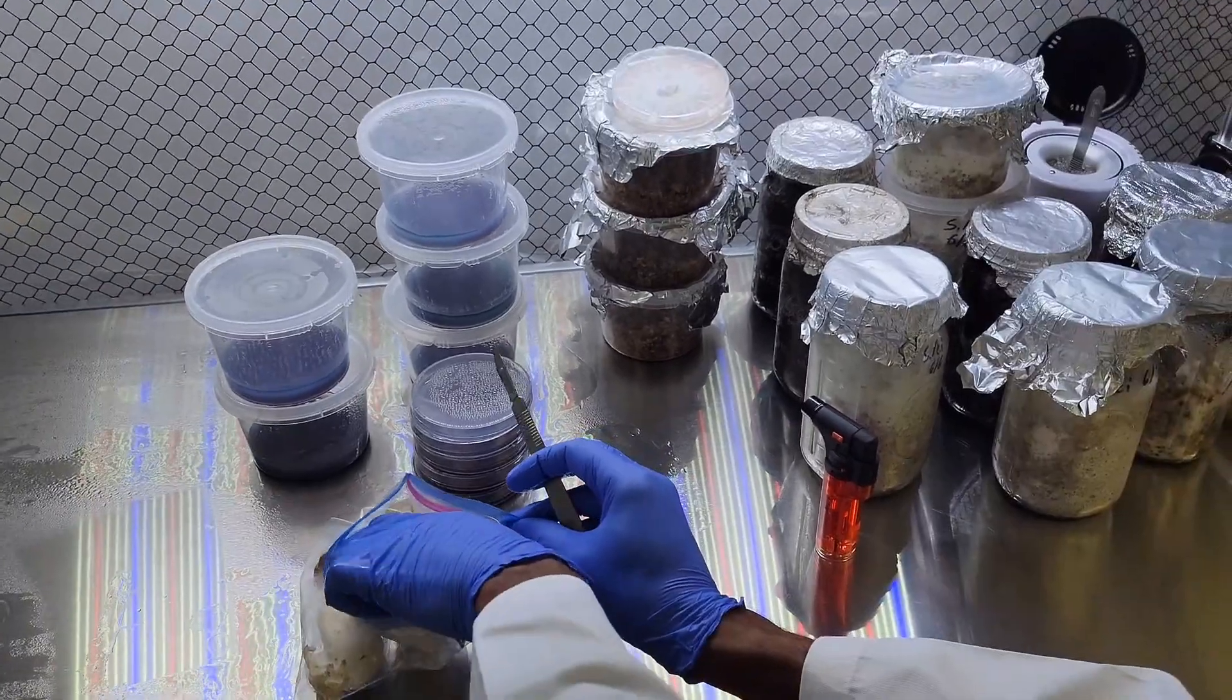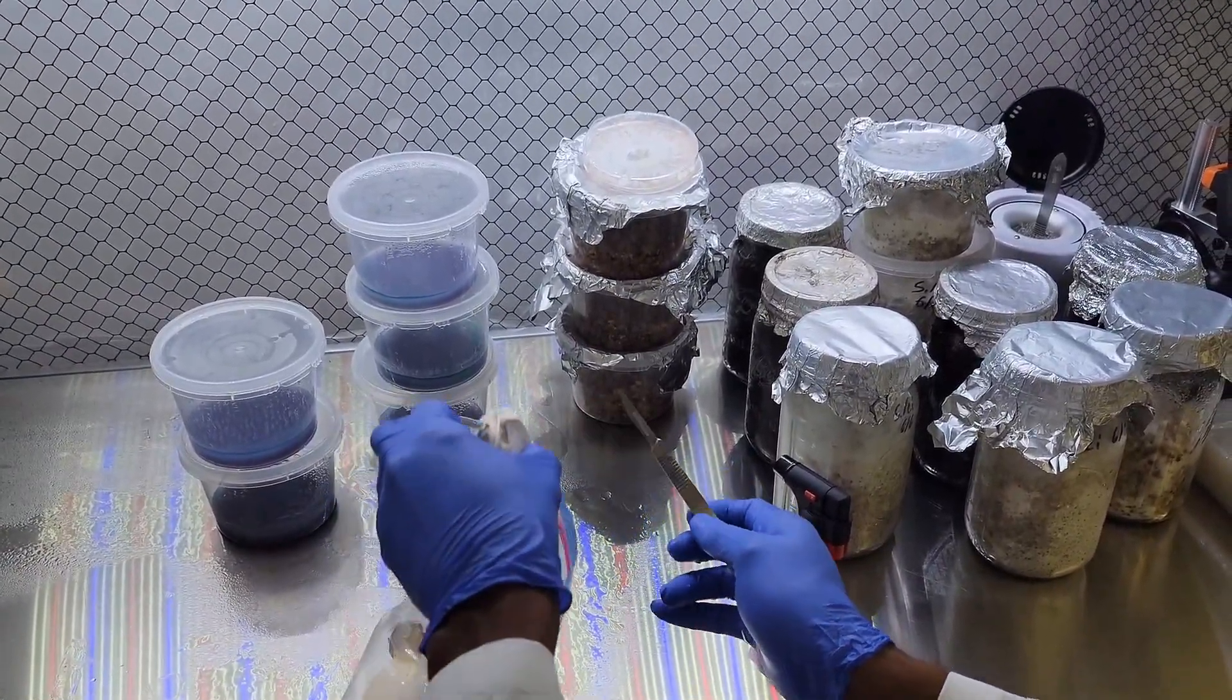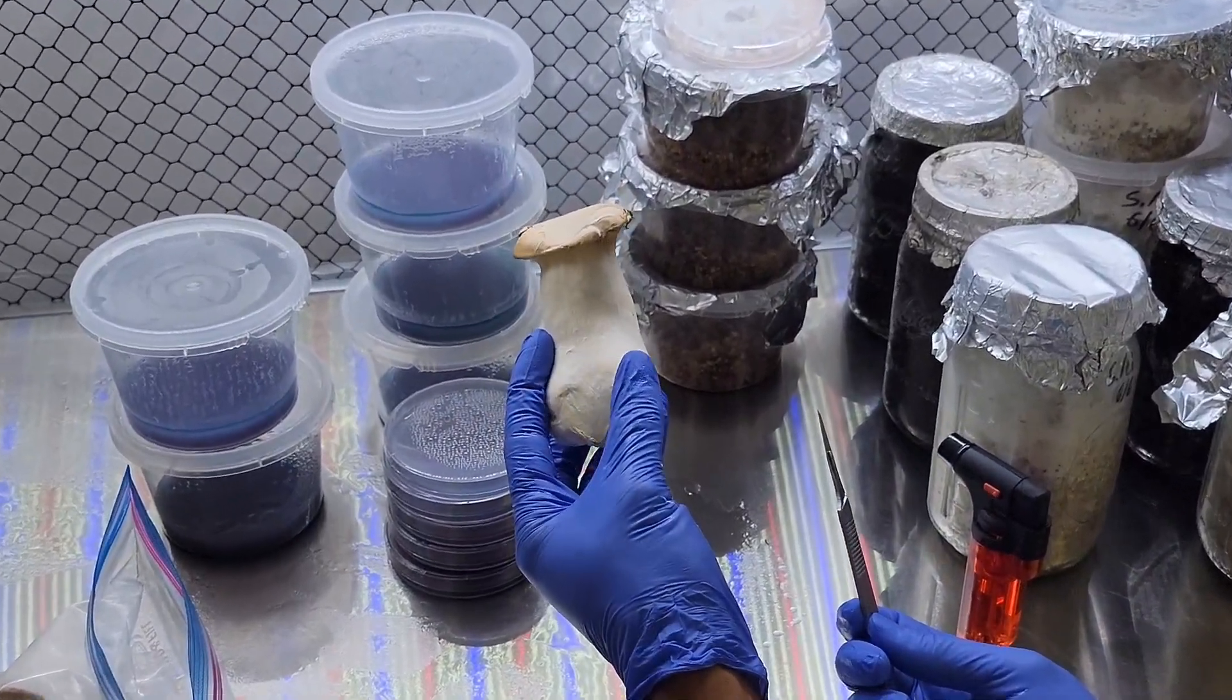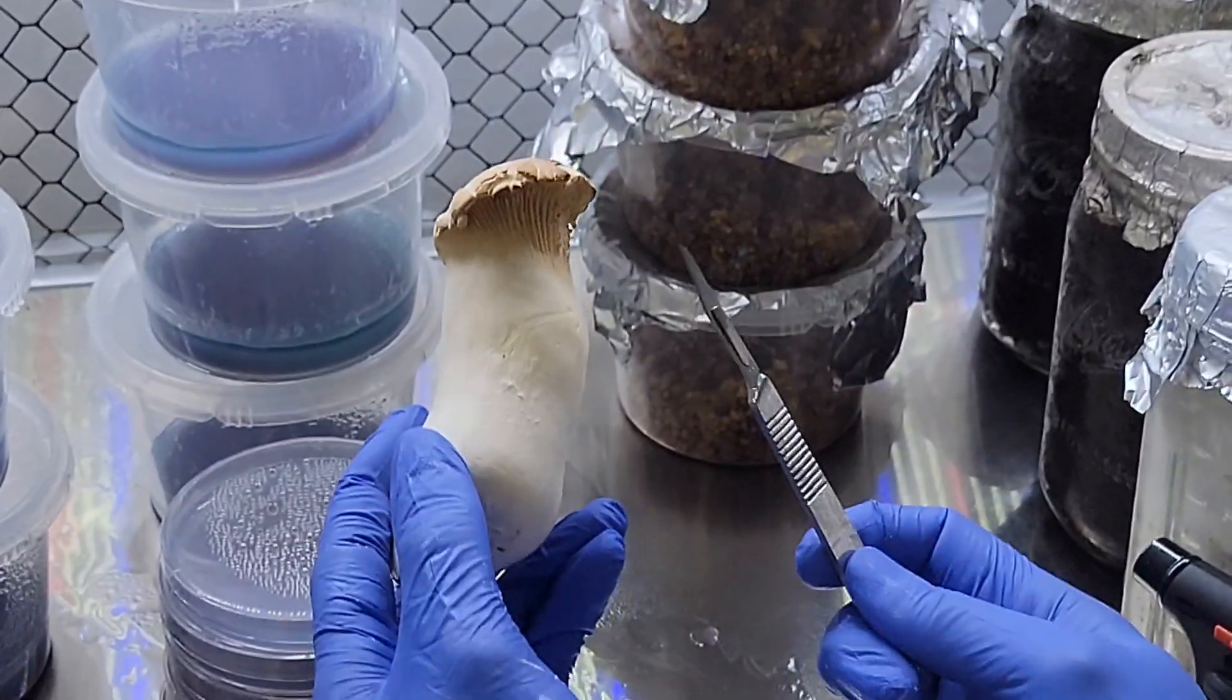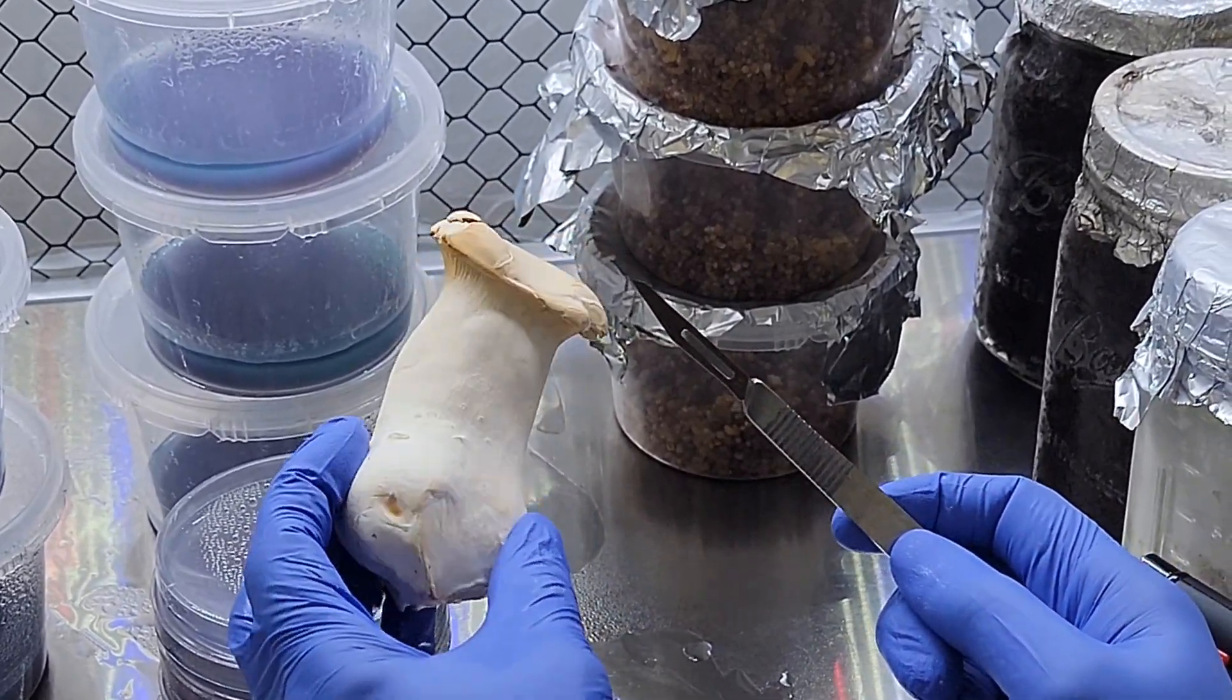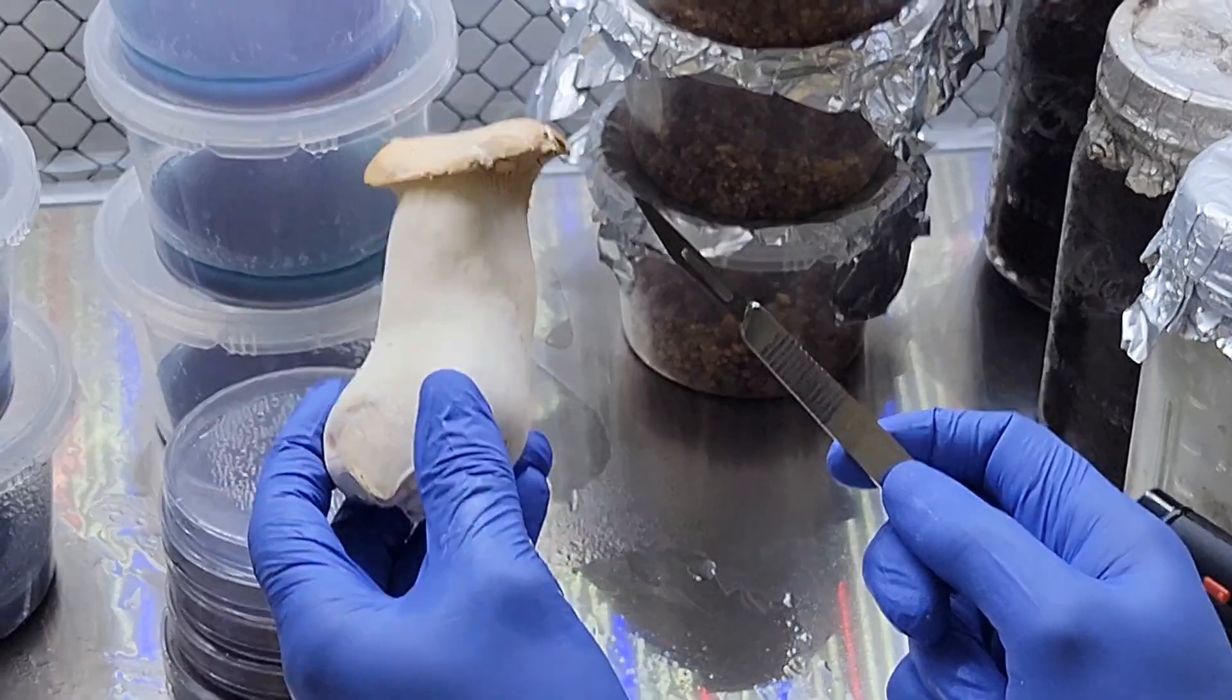This is agar and grain water, so there's no honey in this like in our previous recipe. We're just going to be using grain water to prep them to go onto grain, so they'll already know how to break it down.